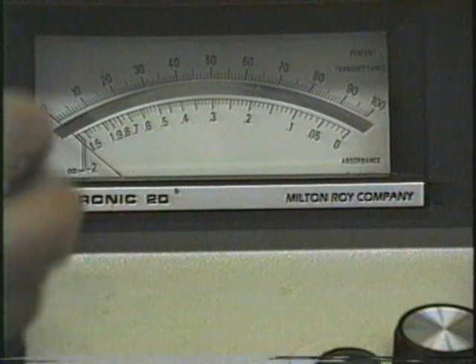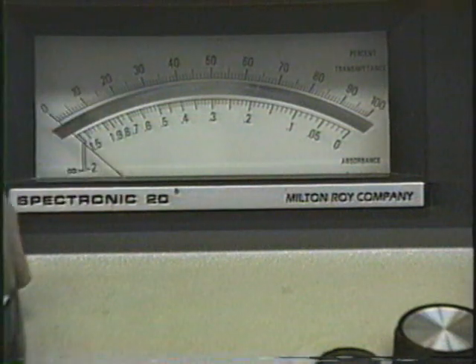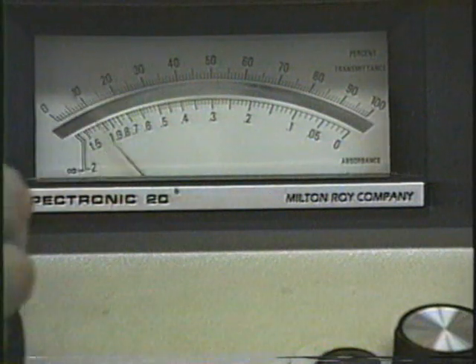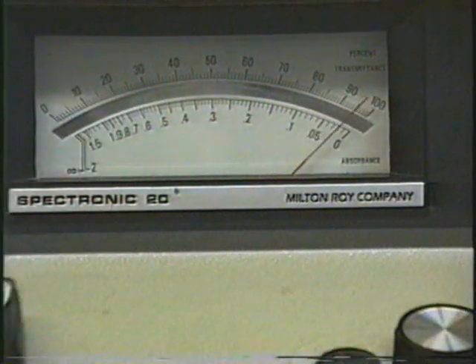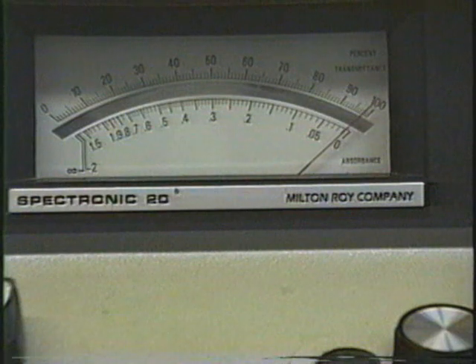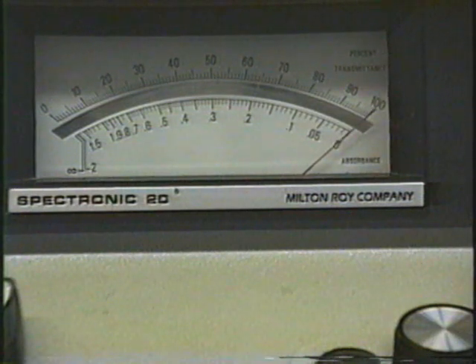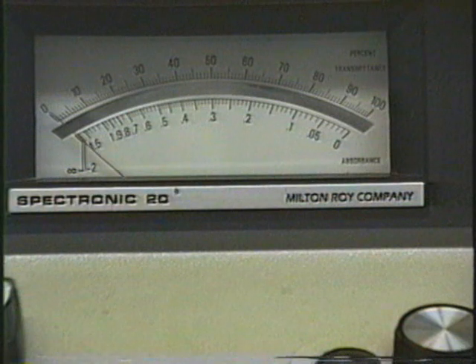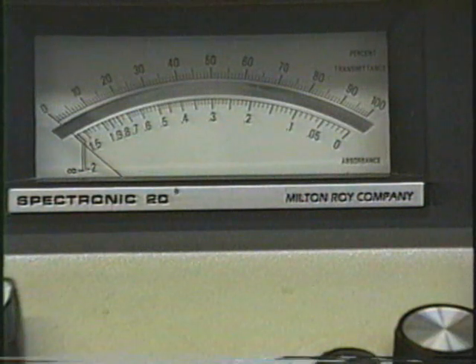And now we'll put the reference cuvette in. Let's get the reference here. Again, line up the trademark and set that up so that it is exactly 100%. There it is. Whoops, the law. There we go. All right. So, now the machine is set exactly.